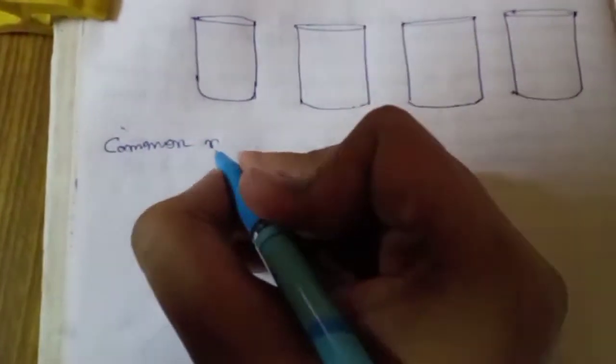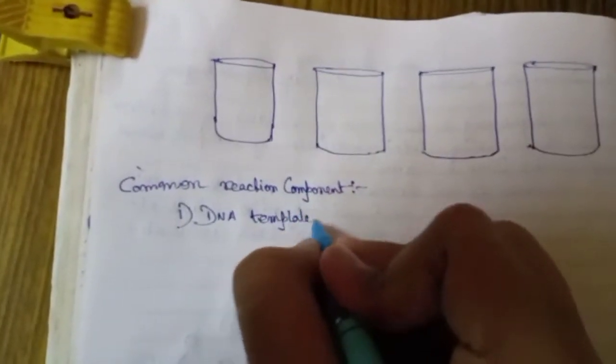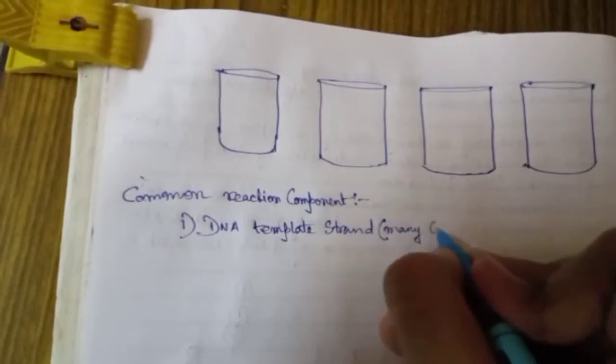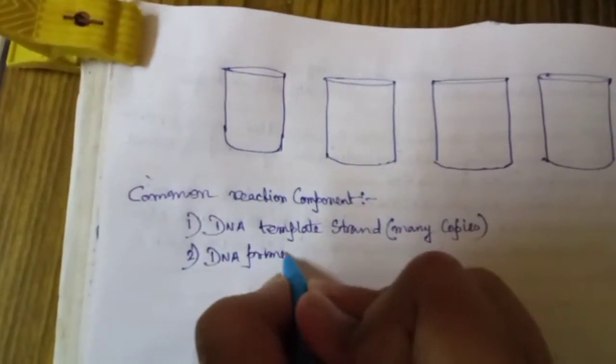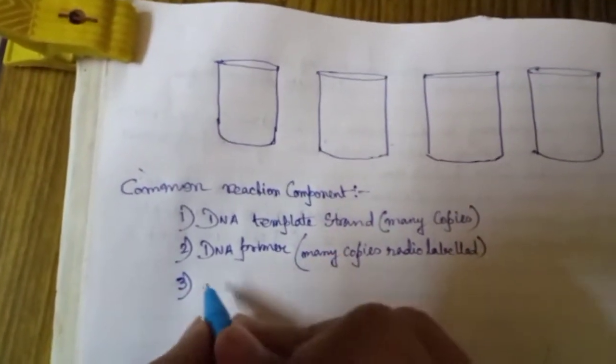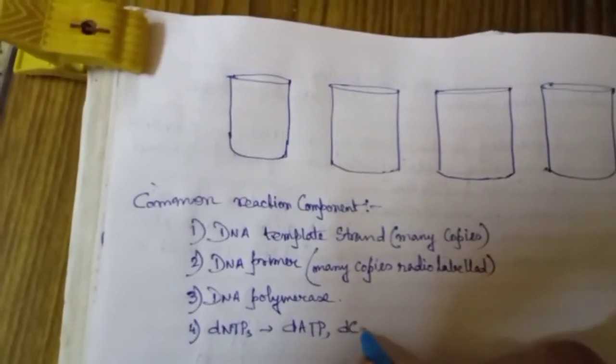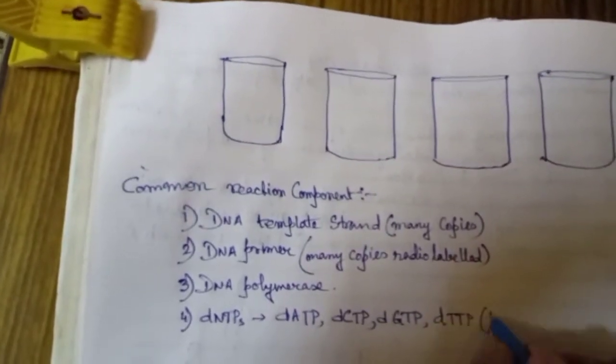Now the most important process is the chain termination reaction. We have to add all components for the polymerization into these 4 reaction mixture tubes. The common reaction components are many copies of DNA template strand, many copies of radiolabeled DNA primer, DNA polymerase, and deoxyribonucleotides, maybe dATP, dCTP, dGTP, dTTP, in large amounts. All are the common reaction components.